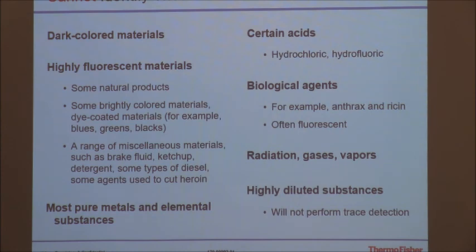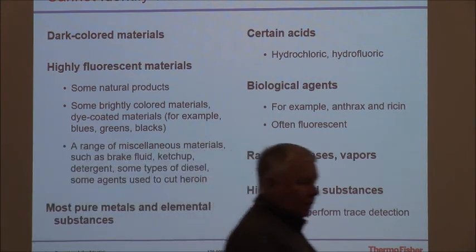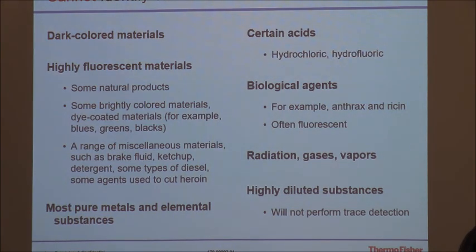Part of the reason goes to safety, but the main reason is fluorescence. FT does not have a color issue. Only the Raman does, so only the ones with the probes have the color issue. Okay? So the darker material.